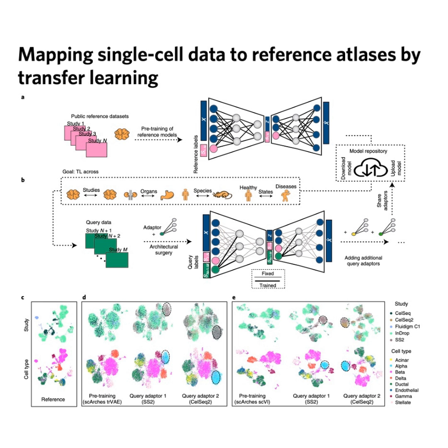So it's learning to separate the technical junk from the real biology. Precisely. It takes all that high-dimensional gene data and compresses it down into a much simpler, low-dimensional map. We call this the latent space. And because it's conditional on the batch label, the camera it came from, it learns to build that latent space so that the batch effects are gone, cells of the same type cluster together no matter which lab they came from. And that latent space, that clean map, becomes our reference atlas.